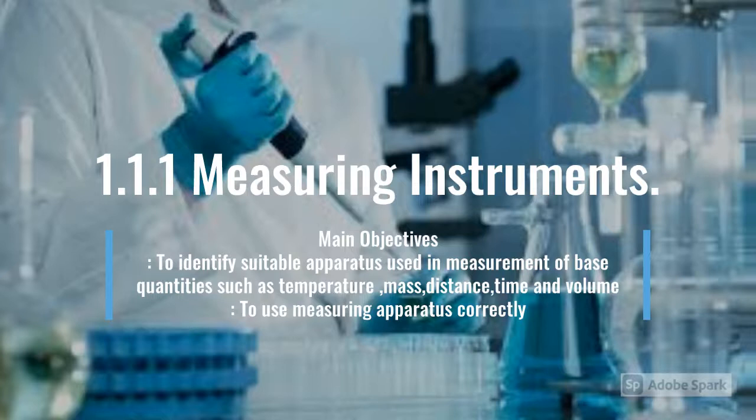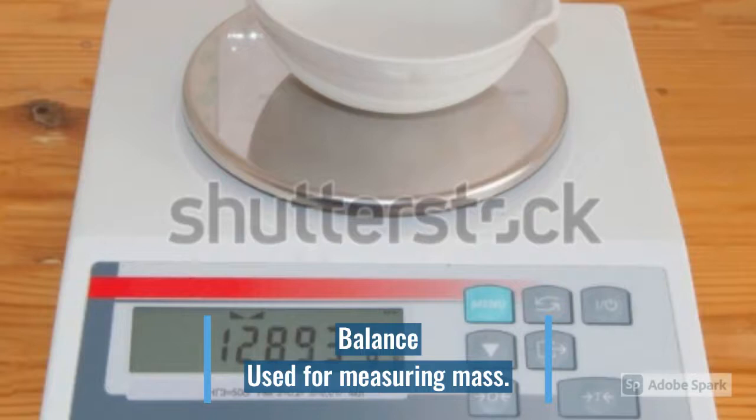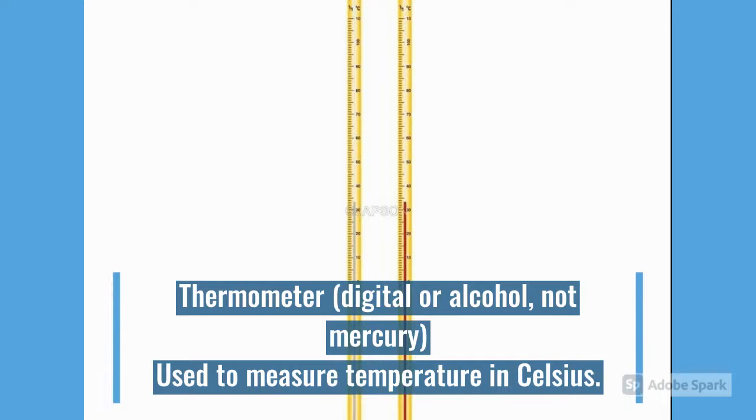Now, let's check out the apparatus used in a laboratory. We have the most common apparatus used in a lab, the mass balance. This instrument is used to measure mass. We also have a thermometer, which can be either digital or alcohol, and this instrument is used to measure temperature, which is usually in Celsius.